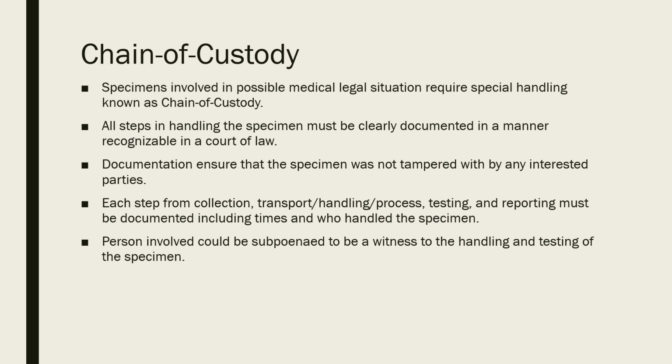So again, making sure specimens are logged from the time they are collected through the time they are resulted in some way, even if it's not a legal chain of custody document, through your records within the lab, that specimen tracking log, whether it's electronic or some sort of manual method, is very important, because if you ever get subpoenaed in, and yes, you could be subpoenaed in because you ran a blood alcohol test on a specimen of a patient that was involved in an automobile accident.